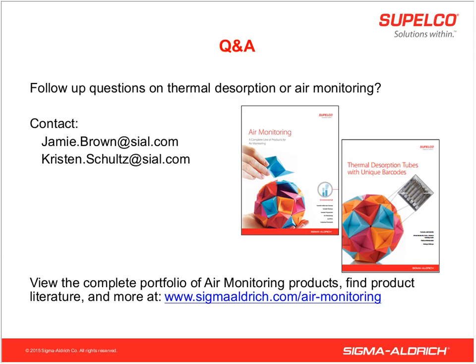Okay. Another question, will particulate be an interference for analysis? That can be. If some of these particulates have some organic material on them and we heat them up to 330 degrees, we might off-gas those compounds into the thermal desorber.